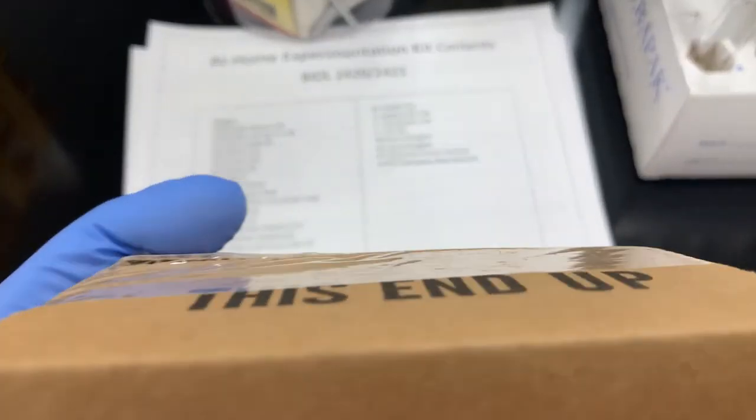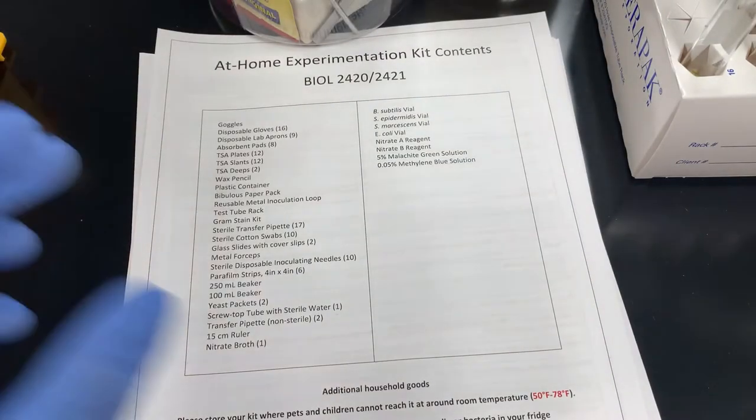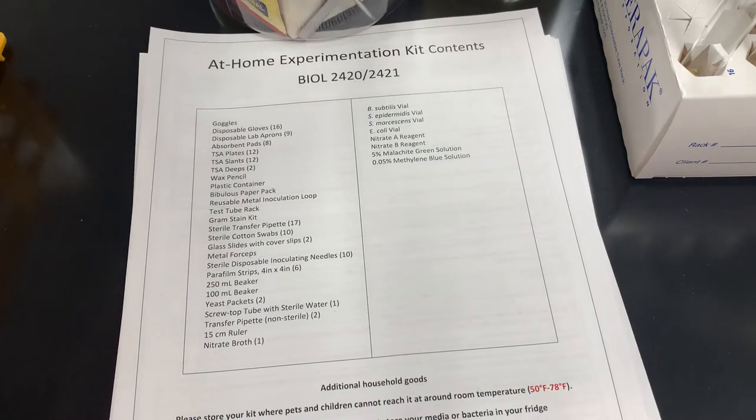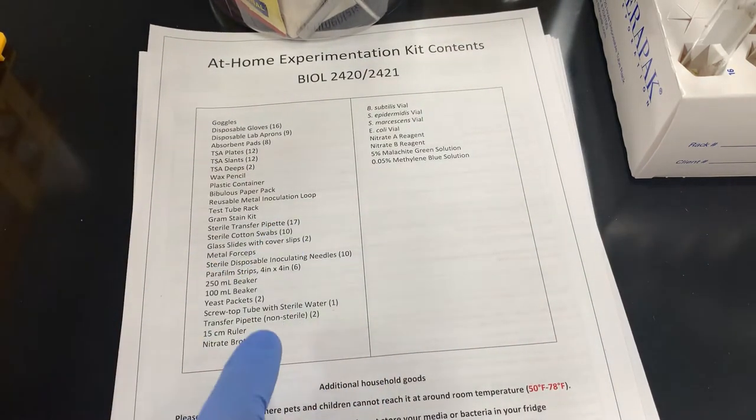It should be sealed. I think one or two of them are open, we just had to make sure that they had the contents in them. Go over that in a gram stain video. We have sterile transfer pipettes. Now, you notice we have 17 sterile transfer pipettes, and then down here we have two transfer pipettes non-sterile.